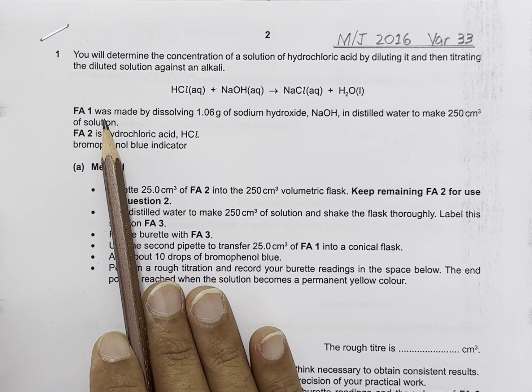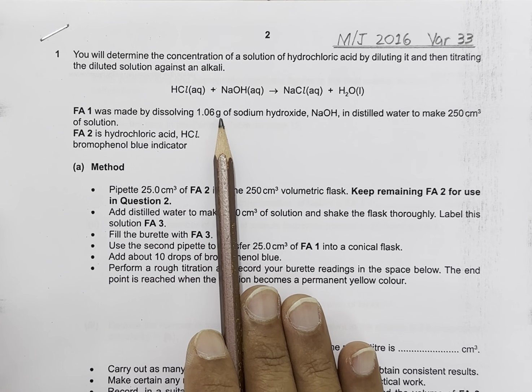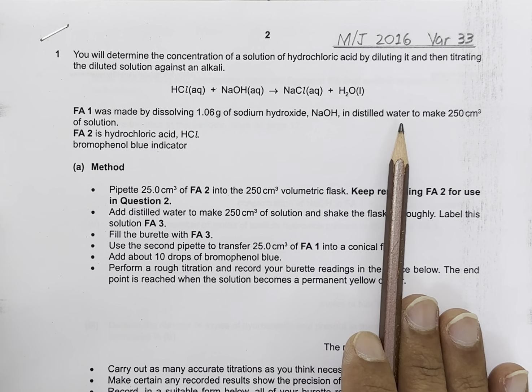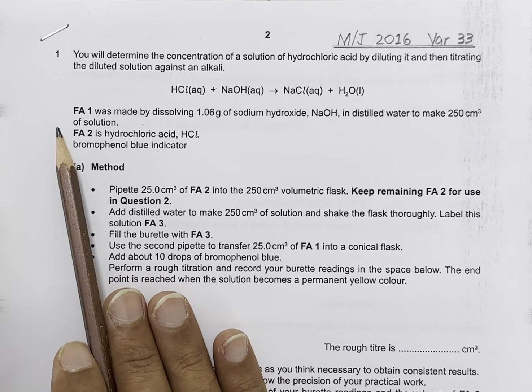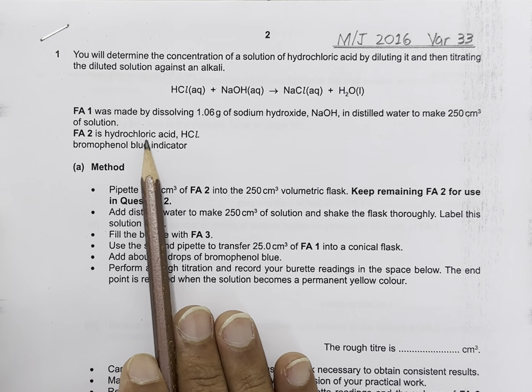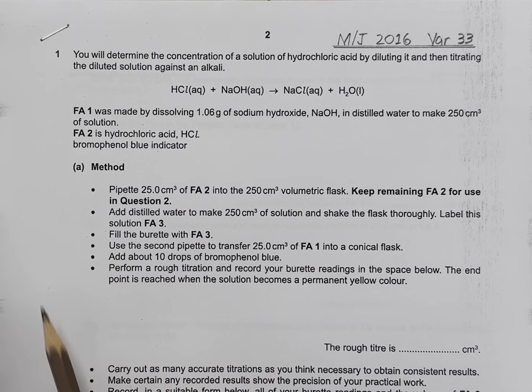Fa1 was made by dissolving 1.06 grams of sodium hydroxide in distilled water to make 250 centimeter cube of solution. Fa2 is hydrochloric acid. In this case, the indicator provided is bromophenol blue indicator.